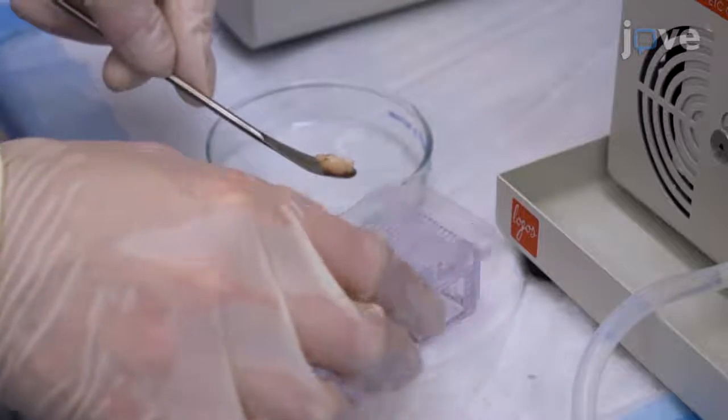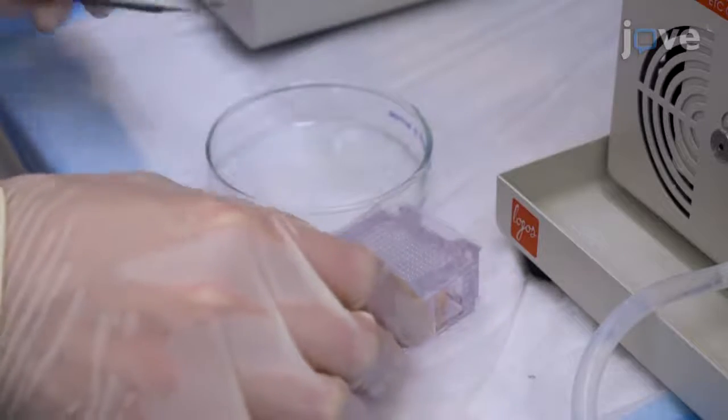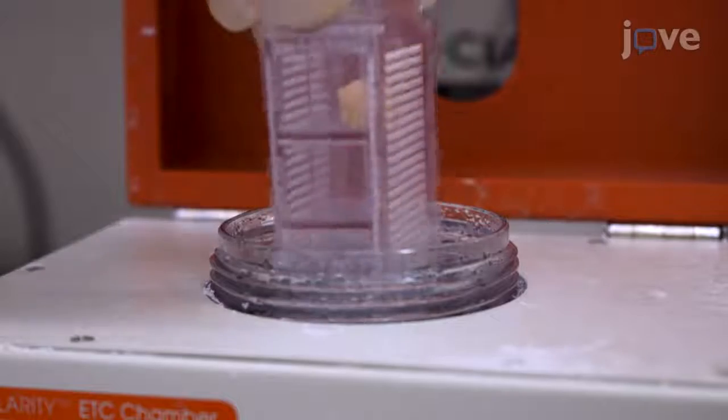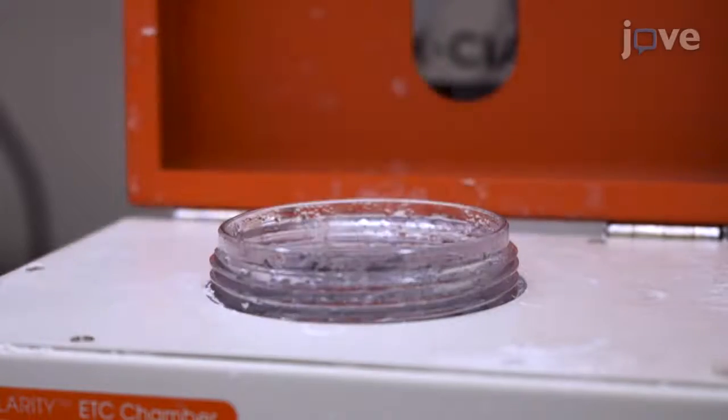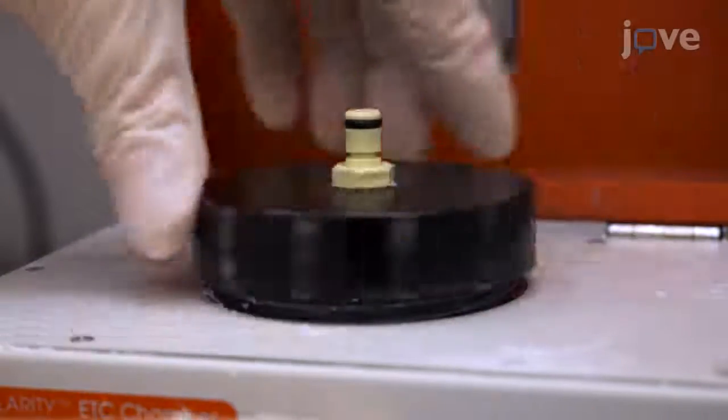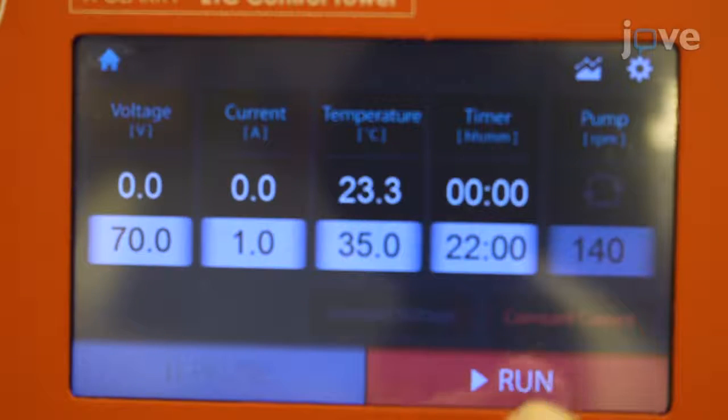Place the polymerized tissue sample in the electrophoresis chamber, keeping track of the orientation of the tissue within the chamber. Fill the chamber and reservoir with the supplied electrophoresis STS buffer.